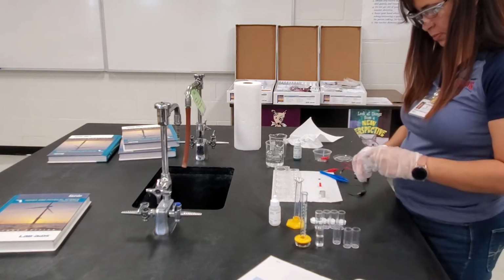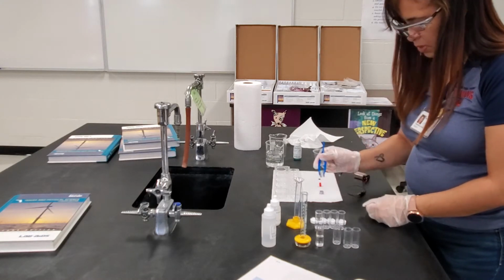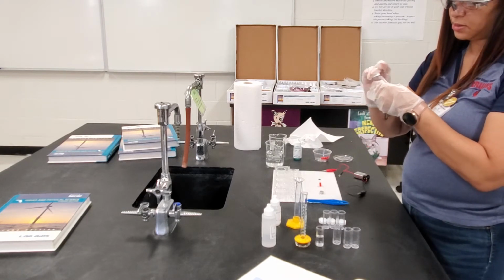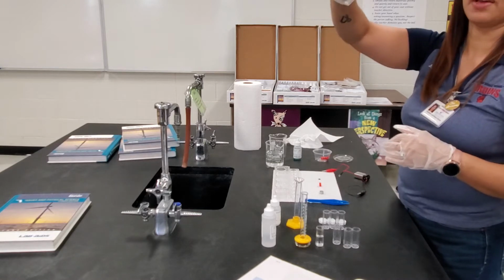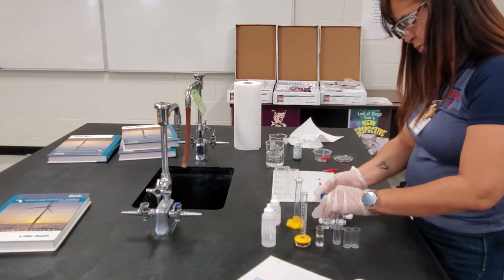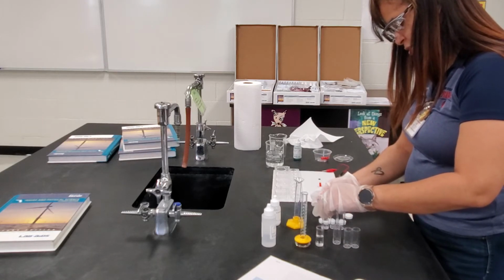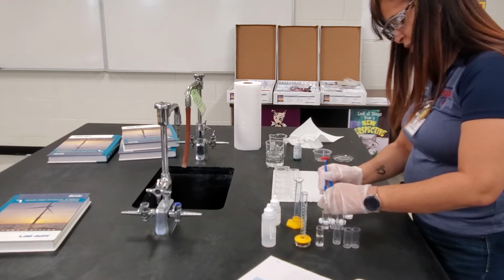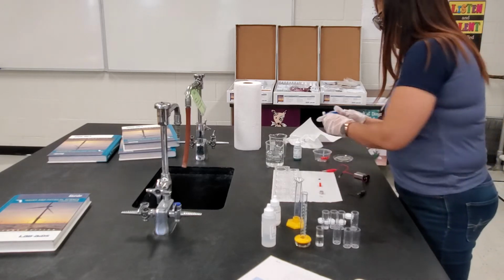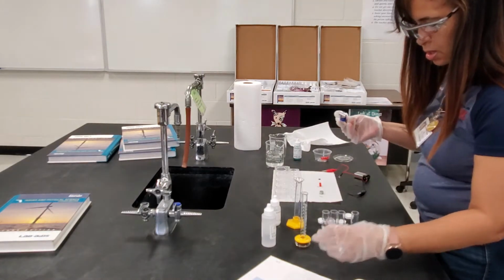So we're going to start with our 2 metallic objects. I'm going to start with the first one, and I'm going to place it in water. And it definitely sinks in water. You can cap it and shake it up a bit, but it definitely sinks in water. So I'm going to pour the water into a second vial so as not to waste it. This is a neat trick to get the water out and not have to constantly remeasure, and at the same time get your sample out. So now we want to dry the sample before it goes in, because again, we do not want to cross-contaminate. So we're going to take this and put it in ethanol.